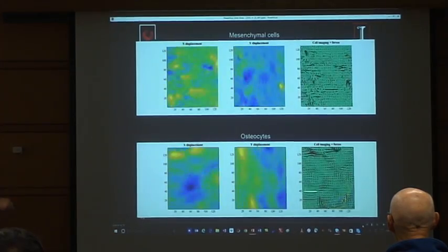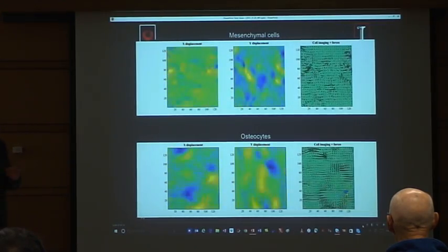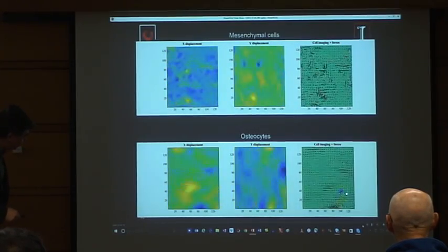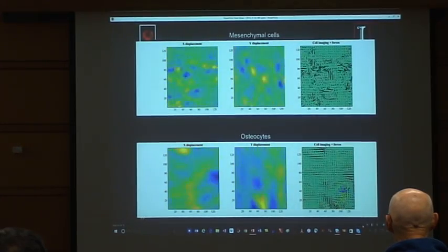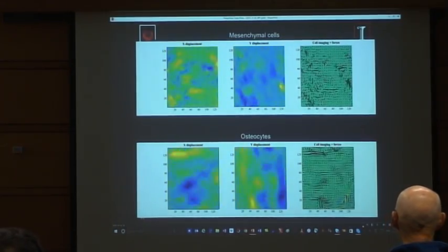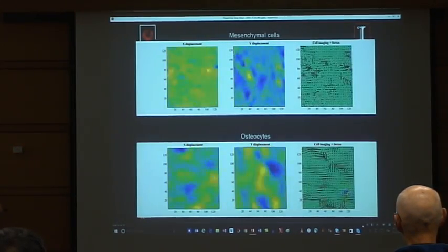So you look at very recent reconstructions. This is XY displacement, and these are the forces. These lines are actually the length of the vectors, and they are pointing in various directions. And if you squint a little bit, you will see these are the SLIM images on top. So the beautiful thing is, the fluorescent channel, which comes in epi, in reflection, gives you the force map. And now in transmission, you do everything you were doing before, growth, whatever. So that's what you see here on top. Probably not the best representation, but this is just very, very recent.